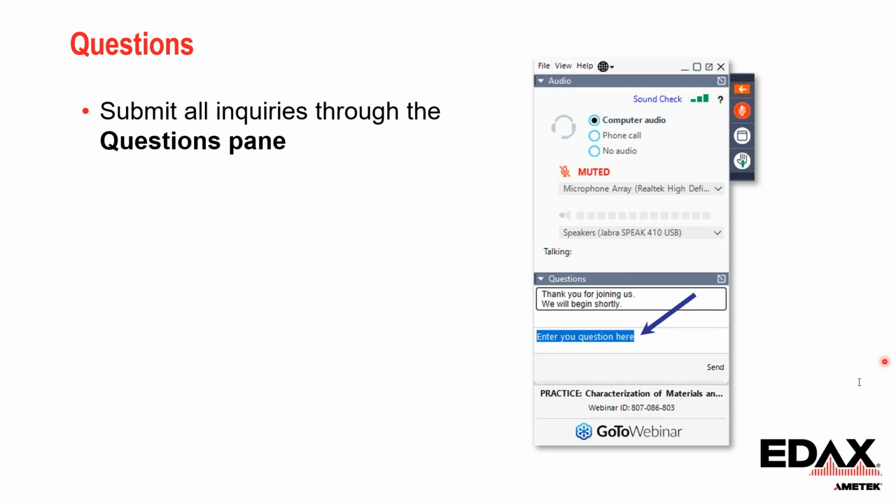If you don't have this information, you can do an EDS survey spectrum in the EDS WDS mode first. The EDS spectrum will help you quickly figure out what elements are in the sample and the elements you want to analyze with WDS. And then you can do the WDS spectrum collection with the elements of your choice.